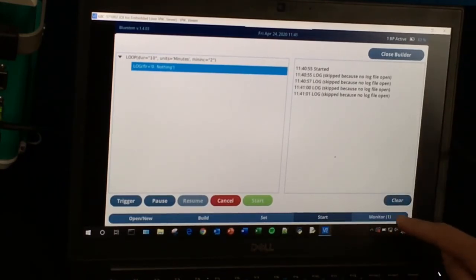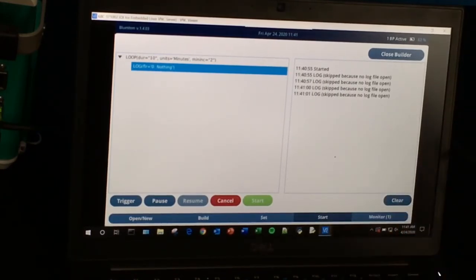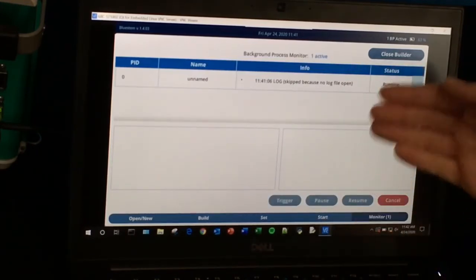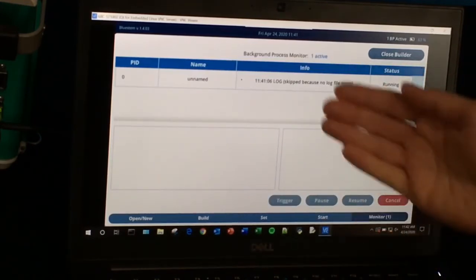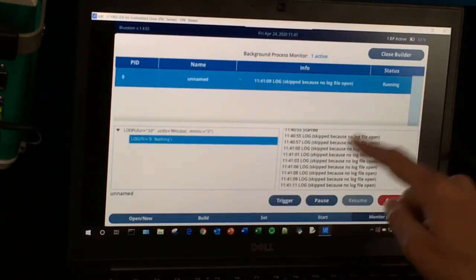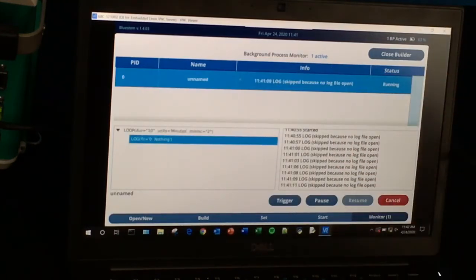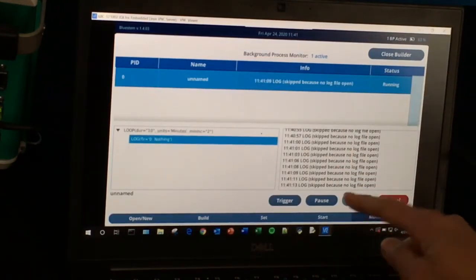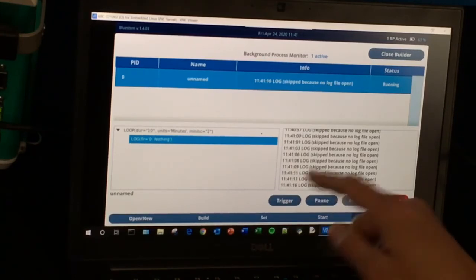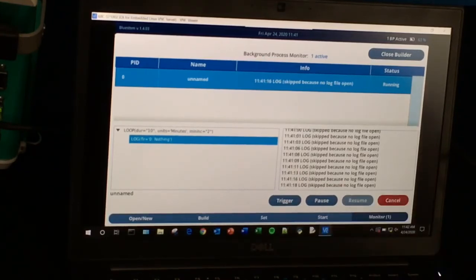We can also go down to the Monitor screen. This is where your running background programs show up. You might be running more than one at a time, and you can highlight one to see what's happening inside it. You can also use the Pause and Trigger controls here. We'll click Cancel.